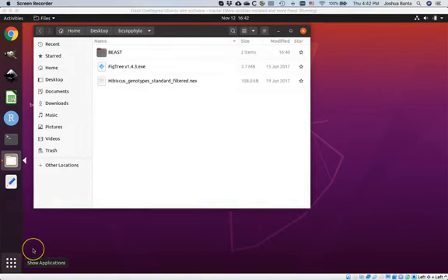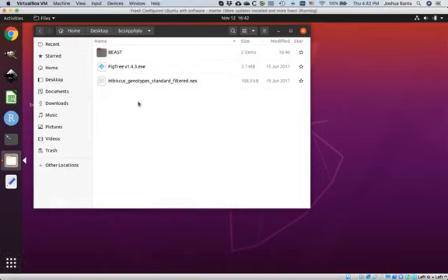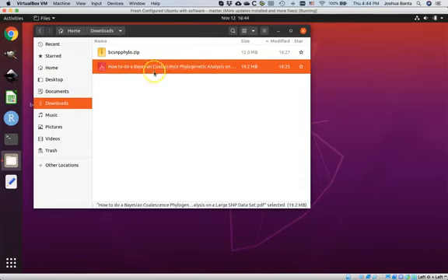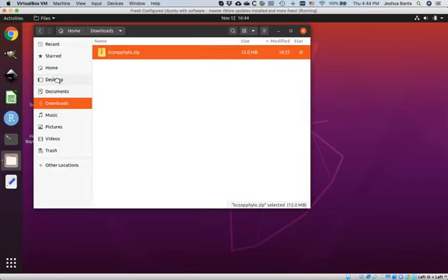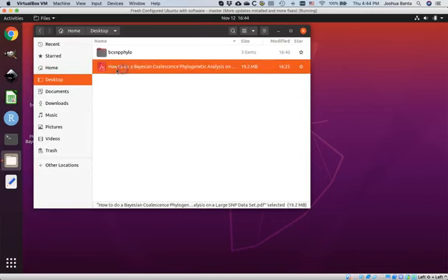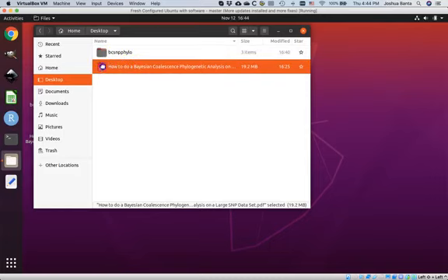Go ahead and close the archive manager window. Now we need to get the written document version of the tutorial out of our downloads folder and put it onto our desktop. Click on the downloads folder within your file explorer window. Here's the file: how to do a Bayesian coalescence phylogenetic analysis. Take that file and drag it to the desktop. Then click on the desktop folder in the file explorer window and drag the file into the bc-snip-philo folder to keep things tidy.